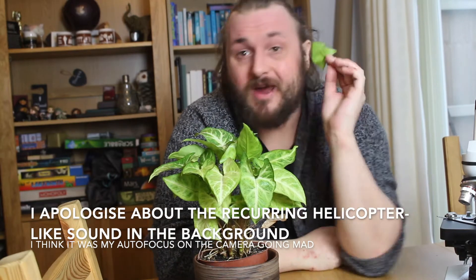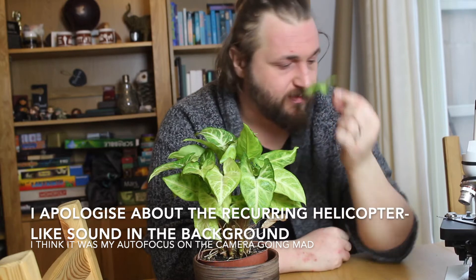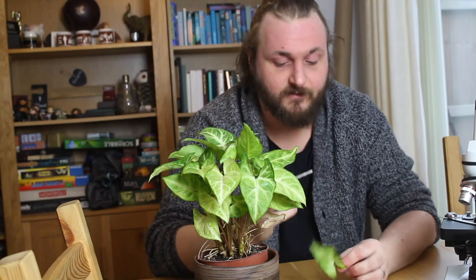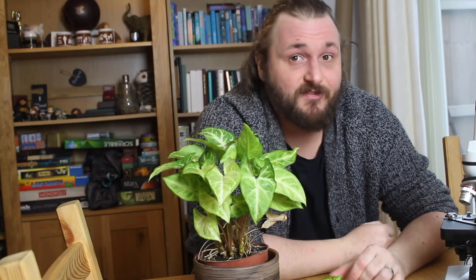Step one is to pick a leaf. You want to be looking mainly on the underside of a leaf, though I'm going to look at the top side as well just for comparison. You want to spread a very thin layer of nail varnish along the leaf and let that dry completely. What the nail varnish does is it creates a film over the leaf — we're not going to be looking at the leaf itself, we're actually going to be looking at the nail varnish.